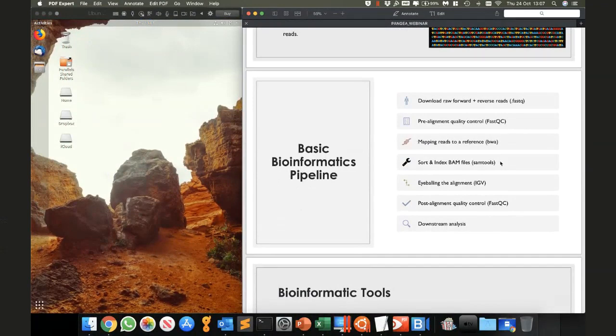We take all of our short reads and overlap them to build one long continuous whole genome. A lot of downstream applications need what's called a sorted BAM file, so we can use another tool called SAMtools to sort these. Instead of having random strings, it sorts them into nice little columns. Again, we'll see some examples of these further down.